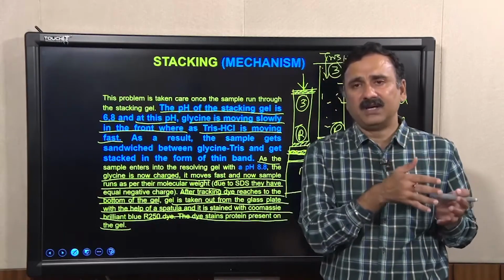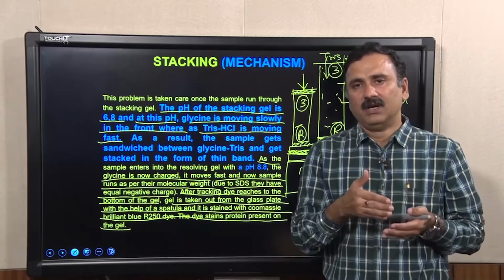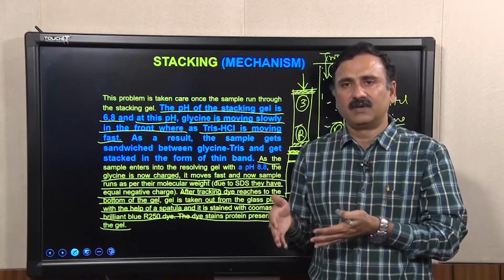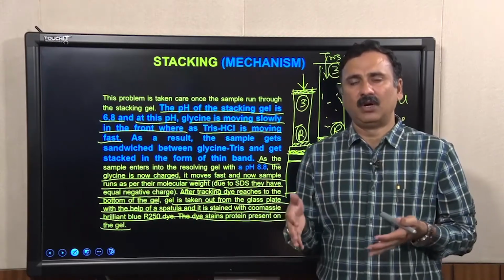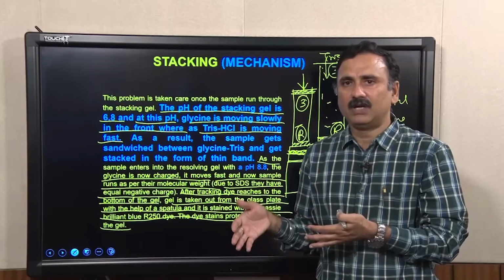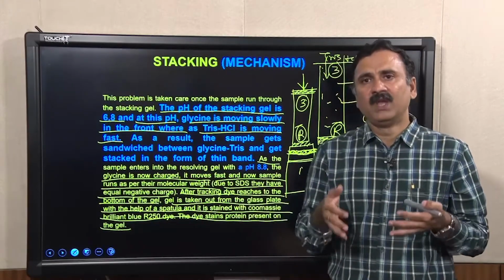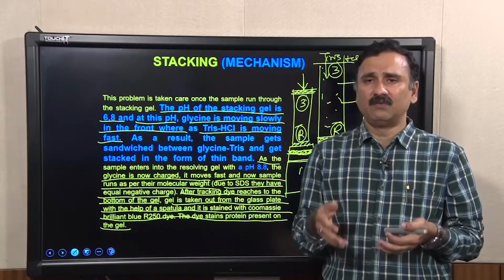So, this is all about the theoretical information on electrophoresis, its history, and how the apparatus has evolved through the development of different types of electrophoretic apparatus. But this is all theoretical knowledge. Now, I would like to take you to my lab and show you a small demo of how to cast the gels and how to perform the electrophoresis.